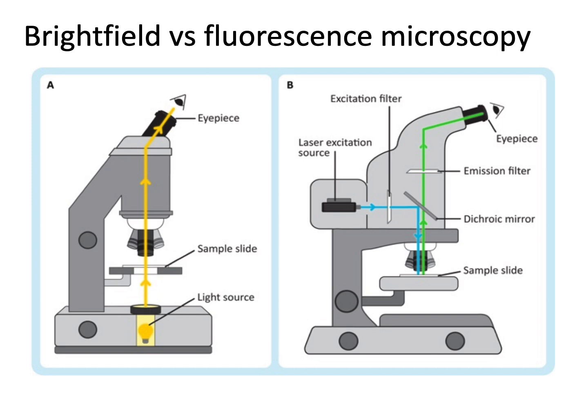And then there's light emitted from your sample, right? So in this case here, the fluorophores were excited by blue light, and now they emit green light. So now the green is leaving your sample, and it follows the typical path through the optics up to the eyepiece. But you can, again, throw in some filters and mirrors to dial in and polish the light going in and the light coming out, so that you don't get noise outside of the sample that you're interested in. Because if you remember, some things are autofluorescent and some things get excited and emit light unexpectedly. So you can really fine tune it just for your sample.